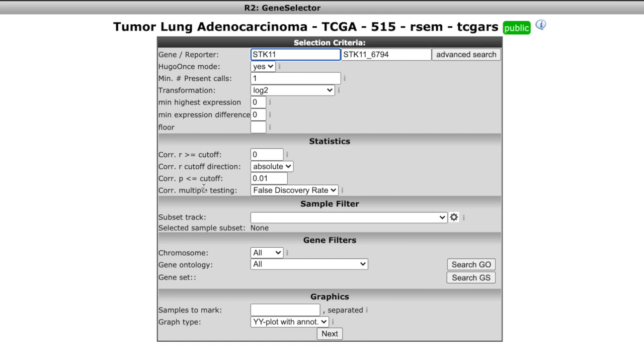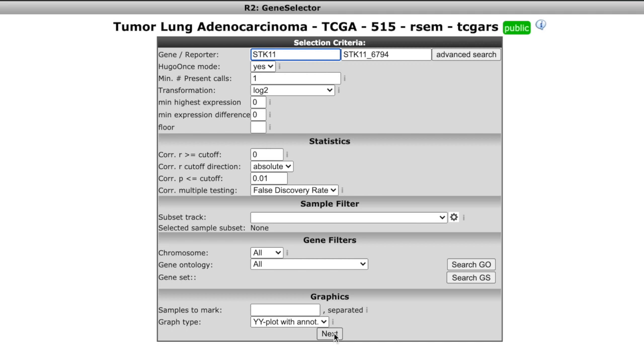But if you wanted to, you can absolutely make this very specific. You could determine how many present calls you want, like false discovery rate. You're putting your parameters around stuff like that. We put our gene in and now we're going to hit next.